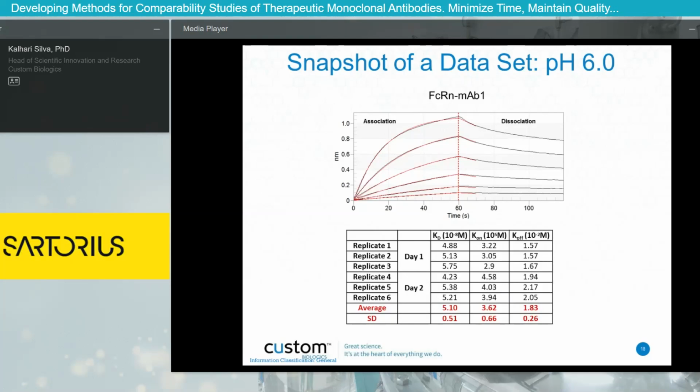So one thing I would like to point out in these Fc binding studies is how we did the fitting of this curve. If you look at the red trace, that represents the theoretical one-to-one Langmuir fit. Despite optimizing the binding assays very carefully, sometimes these Fc receptor bindings to mAbs display some sort of complex kinetics, where the dissociation step can sometimes be biphasic.